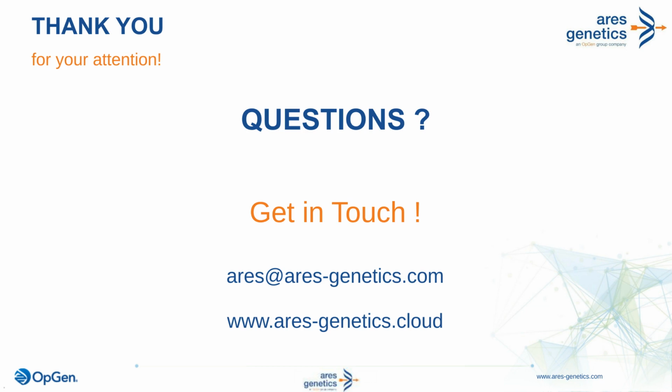That's a good question. In theory, deep metagenomic sequencing can detect any AMR marker in a sample. But especially for, let's say, environmental surveillance, think for example of surface swabs or sink swabs, water samples, and so on, the bacterial DNA in a sample can be so sparse and the background of unrelated DNA so high that shotgun metagenomic sequencing is starting to struggle to achieve good sensitivity and reproducibility.